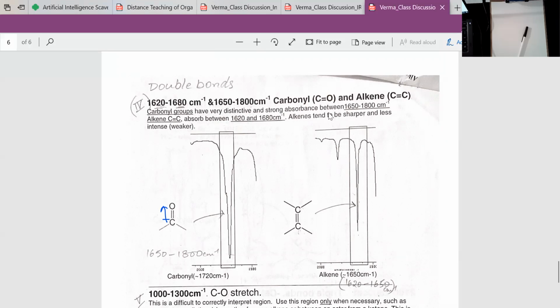And out of the two double bonds that we know we have been using and we will use a lot are the C double bonded C and the C double bonded oxygen. Very rarely we will use the C double bonded N. So for most of your samples, you will see the C double bonded oxygen and the C double bonded C.